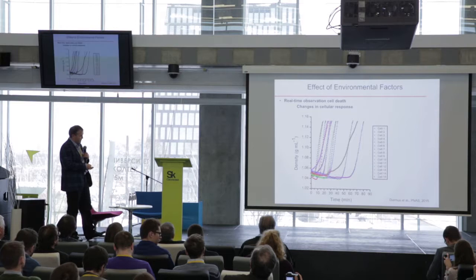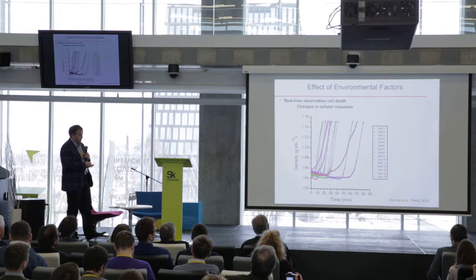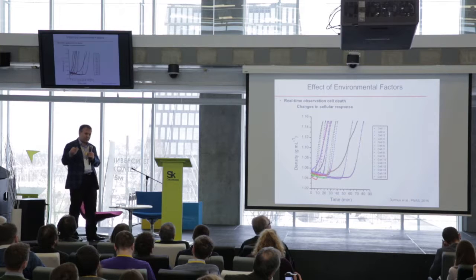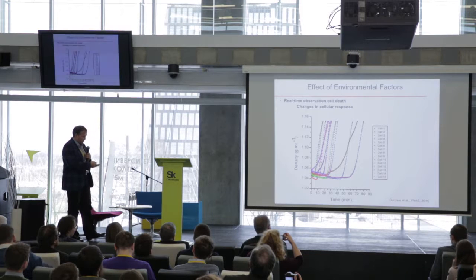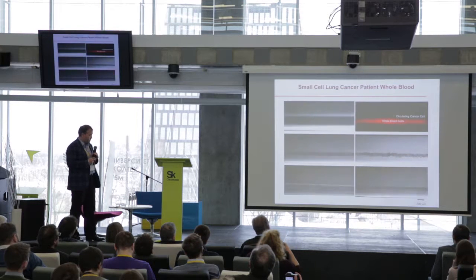Since we can track a single cell's density over time, this is the video that you've seen, the cells falling down. You can see how resistant these cells are at a single cell level to a certain stimulus, such as a drug and so forth. And these were all published last July in PNAS and discussed in detail there.